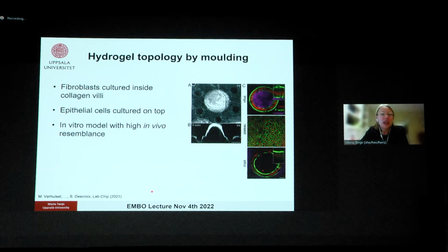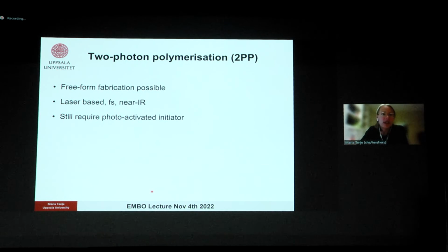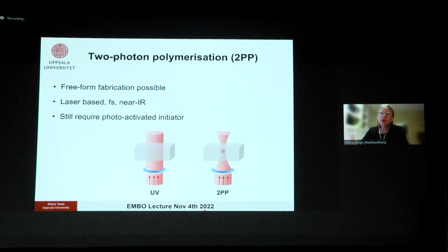But my favorite fabrication technique for 3D microfabricated scaffolds is really two-photon polymerization. That's quite a novel technique, and it enables free-form fabrication possibility because it's laser-based, and you can then expose a material and initiate this cross-linking. You still require the photoactivated initiator to be mixed inside, but the advantage is that if you compare to UV exposure, then you have a column of light that goes through the whole part of your matrix. Whereas if you work with two-photon polymerization, it's only at the voxel, at the focal plane of your laser, that you will initiate cross-linking. And that means that you can write structures inside the gels with a very high resolution and accuracy.